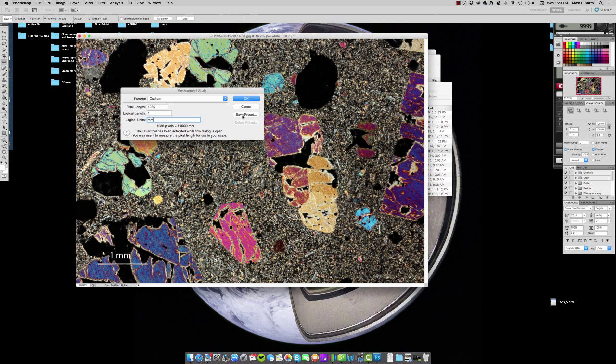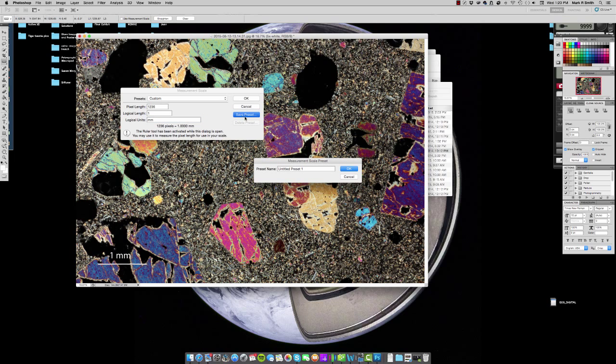Because this is the 5DSR, I'll just call it the MPE 65 millimeter with the 5DSR camera sensor. And then I'll go ahead and I'll save this.